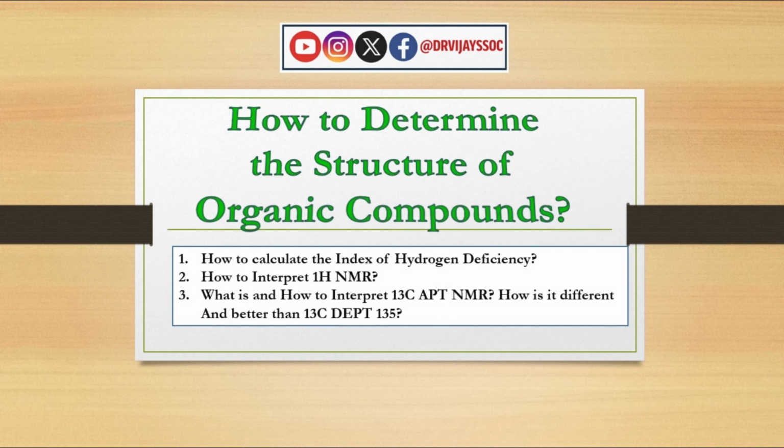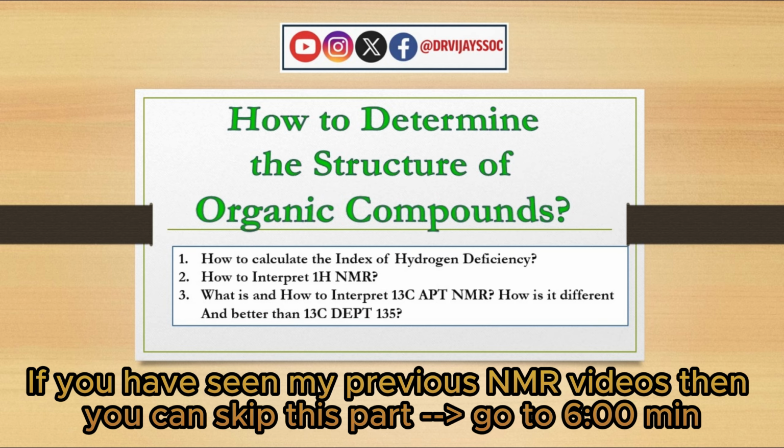So while determining the structure of this organic compound, we are going to follow all those steps which we learned in the last videos. So first we will calculate the index of hydrogen deficiency, then we will look at 1H NMR, and after that we will look at 13C APT NMR.